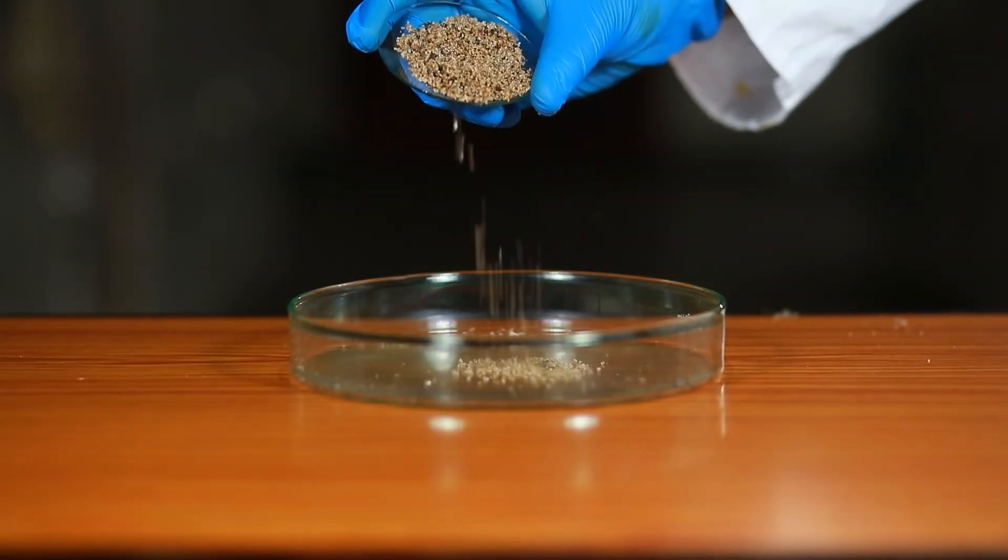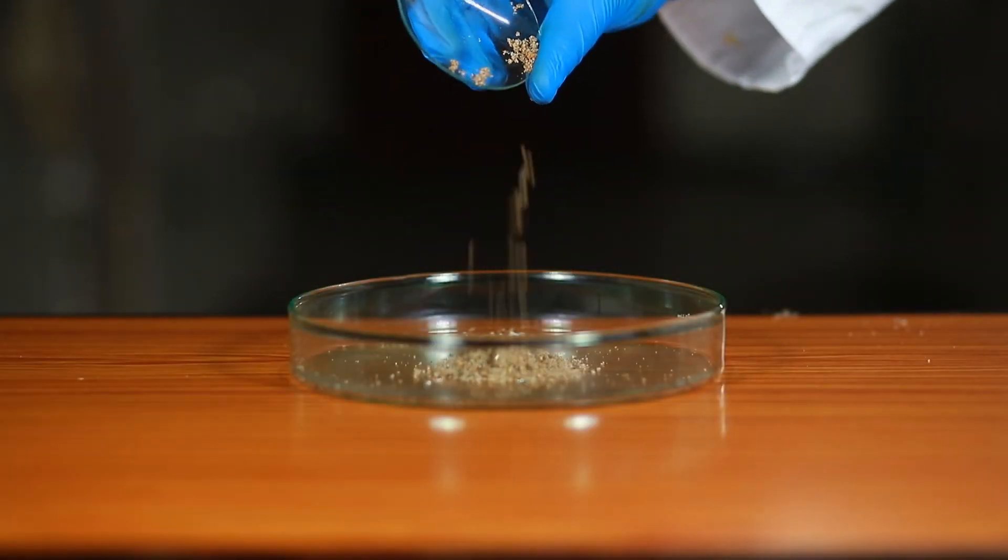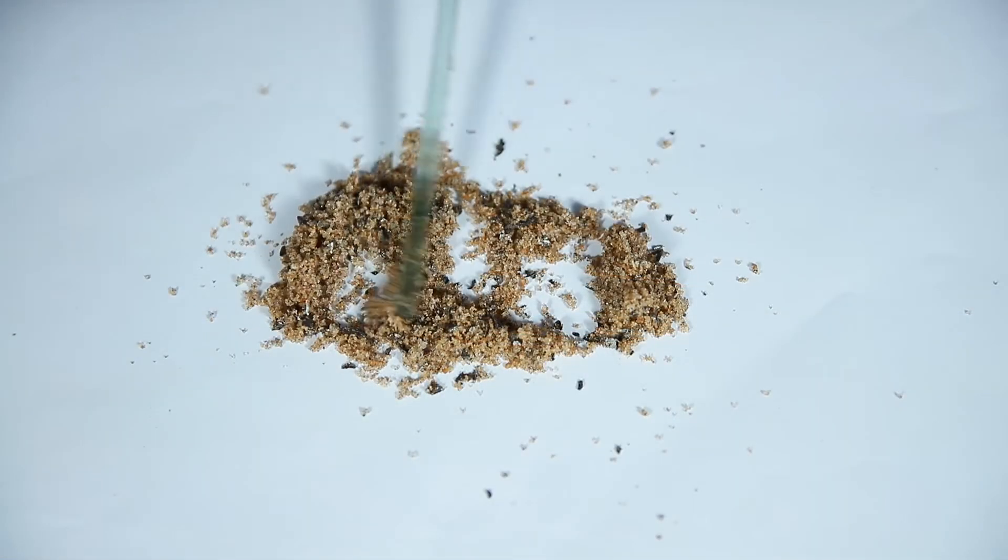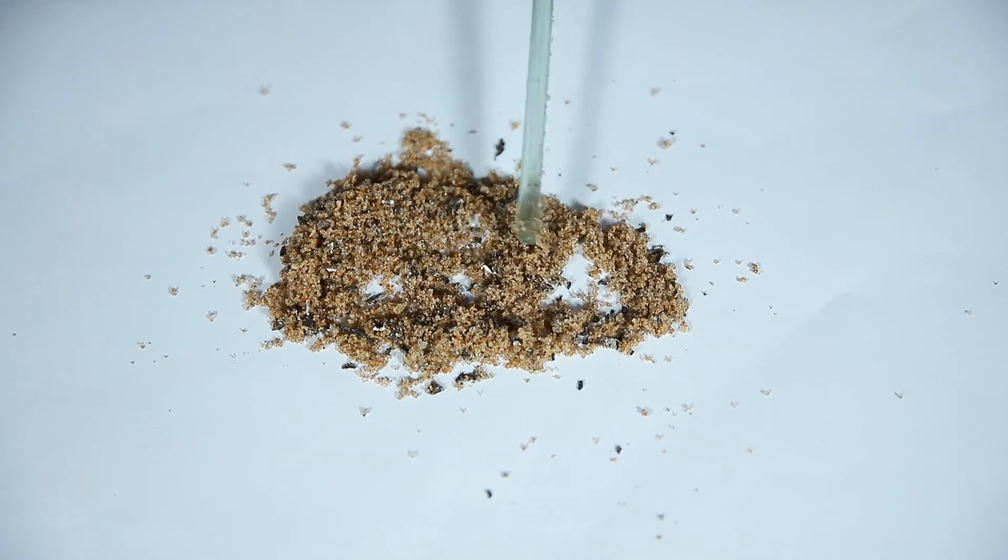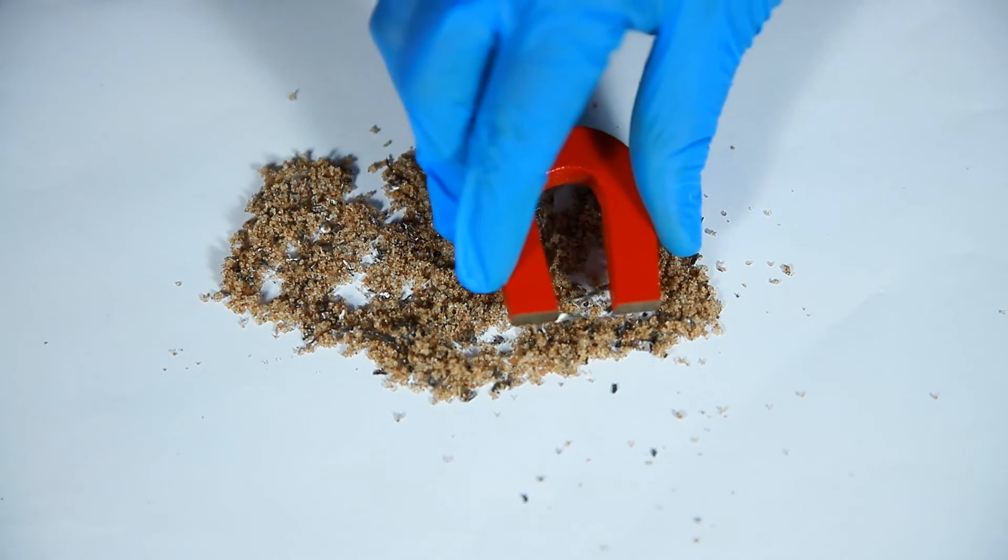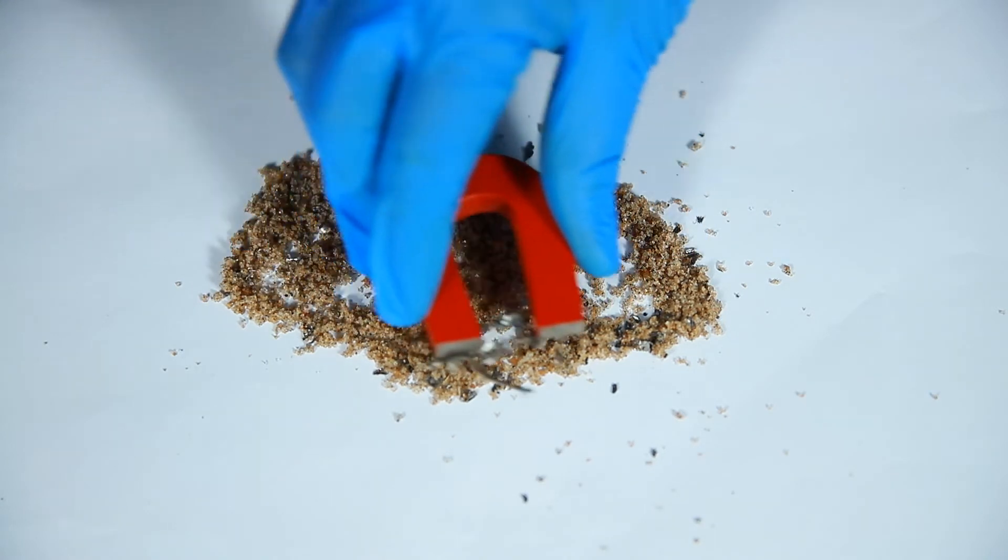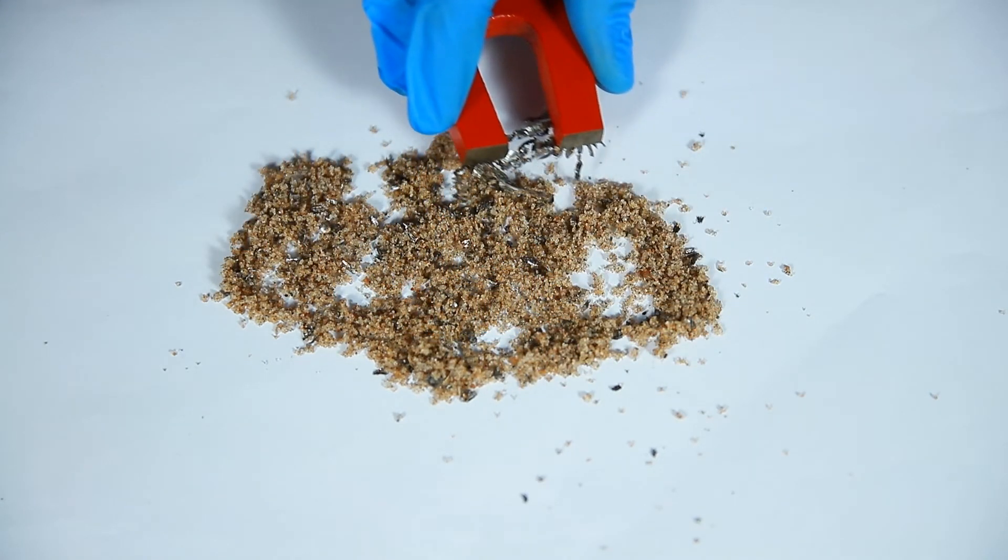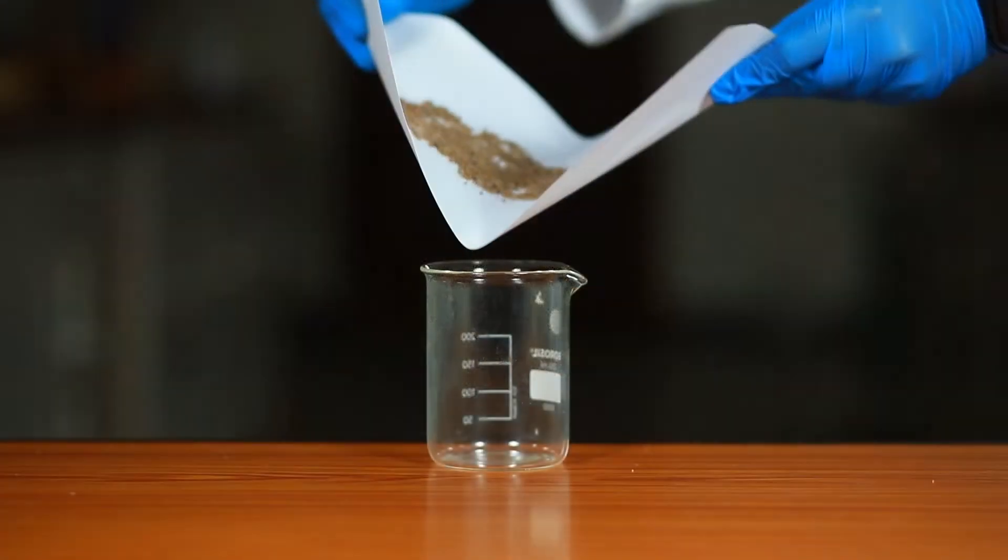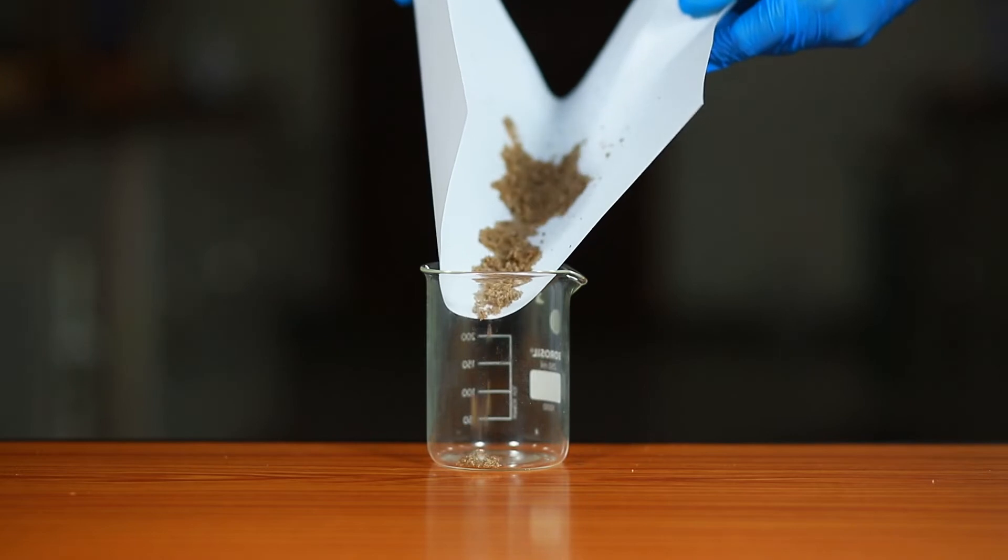Take a small amount of the given mixture of iron filings, sand, and common salt in a Petri dish. Using a glass rod, spread the mixture. Move a magnet over the surface of the mixture. We observe that iron filings stick to the magnet and are thus separated. Fill a beaker with the residual mixture after the iron filings have been removed.